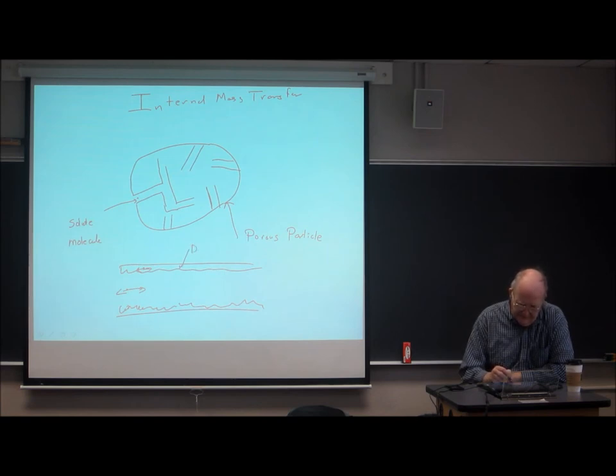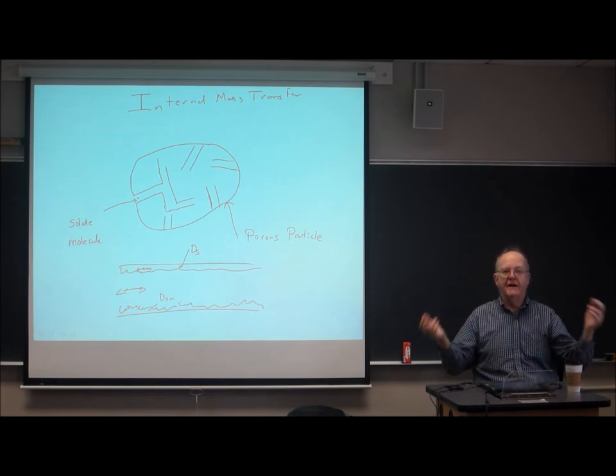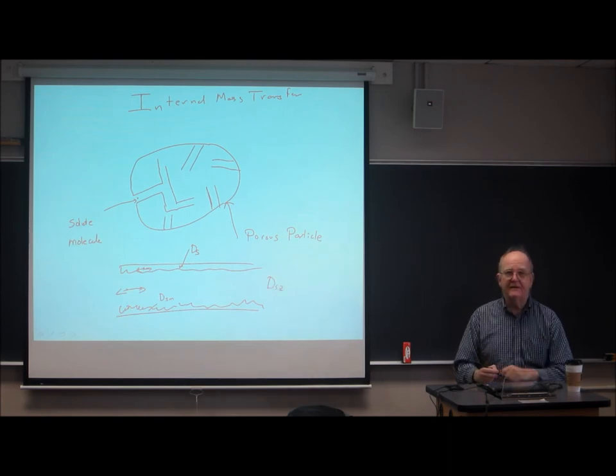This we would call DS, and this we would call DSM. And the diffusion in both phases taken together is happening in parallel. And when we combine them in parallel, that's what we call diffusion in the stationary zone. The stationary zone includes the mobile phase that's inside the particles, and it includes the film of stationary phase inside the particle, and that would be DSZ, which incorporates both of those kinds of diffusion taking place in parallel.